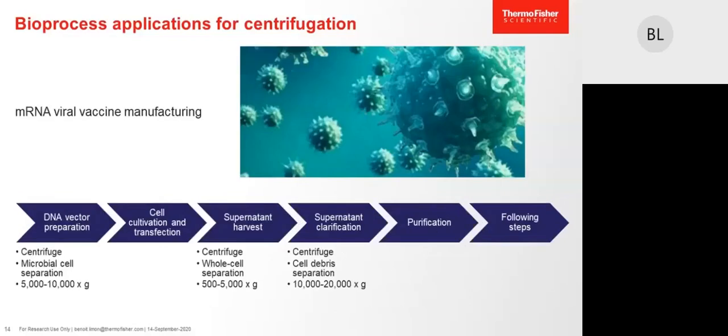This is the mRNA viral vaccine, typically the COVID vaccine that we all hear about in the news nowadays. This also uses the centrifuge as a step to prepare the DNA vector, almost similar to gene therapy manufacturing.